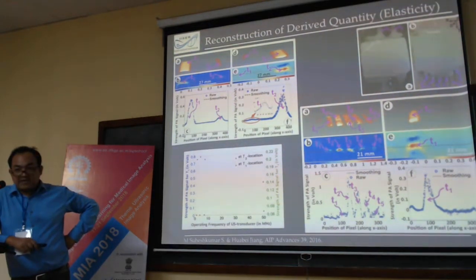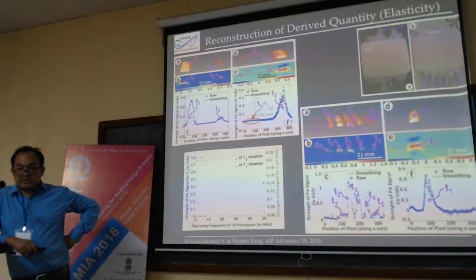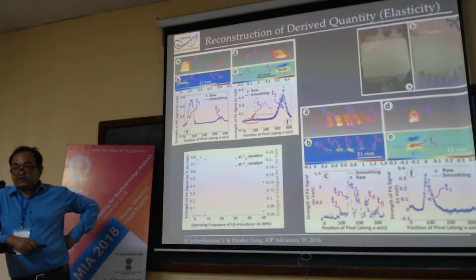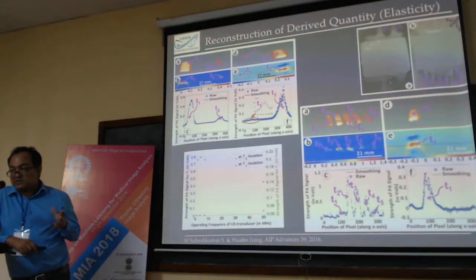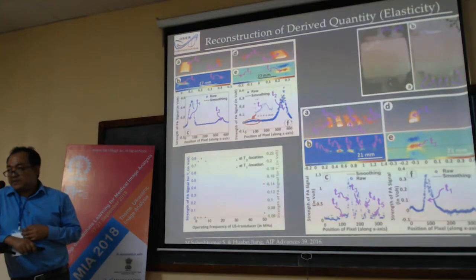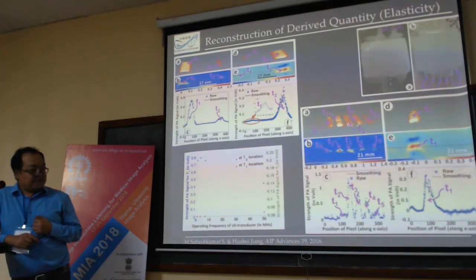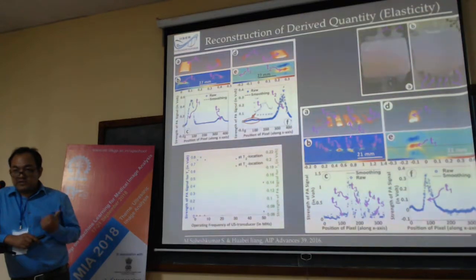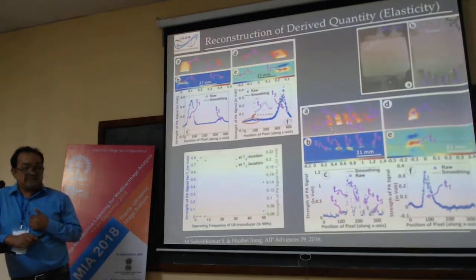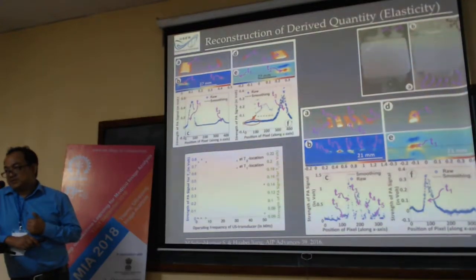When we first tried the conventional ultrasound transducer that people use for photoacoustics, of 1 to 10 megahertz, we did not get any signal. Then we tried 50 megahertz, and we got it. One thing to remark is that the signal arising from the elastic property and absorption is very, very low as compared with the contrast in optical absorption.